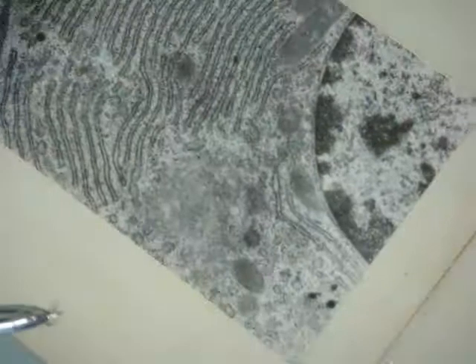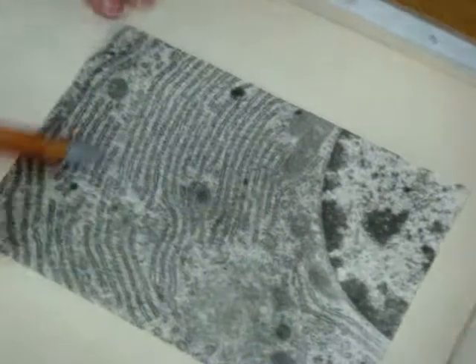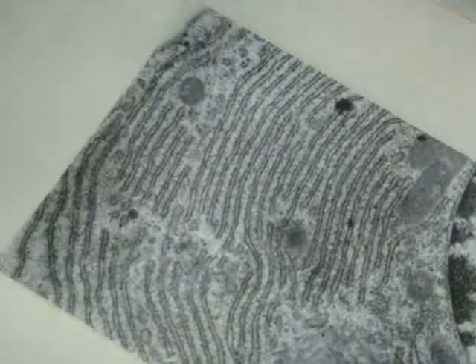Okay, how many cells here? One, part of one, yes. We can see the nucleus, a lot of rough endoplasmic reticulum. And look please, we can see the cell membrane underlain by basement membrane. So, what tissue? Epithelium, yes. It can't be connective, can't be muscle, not nerve, so epithelium.